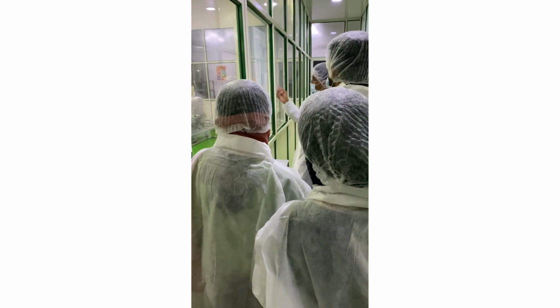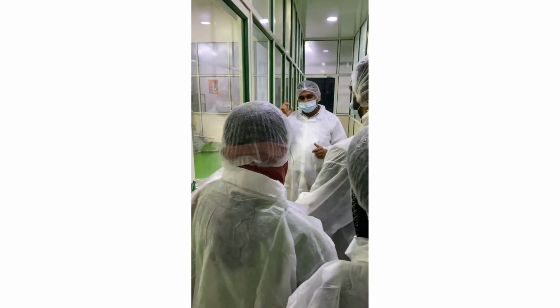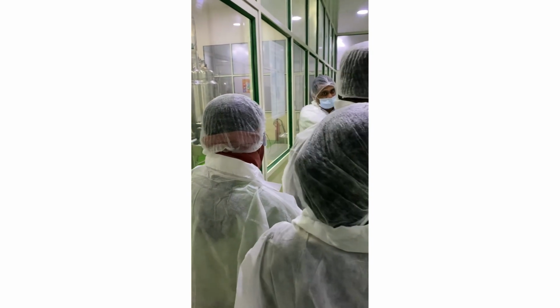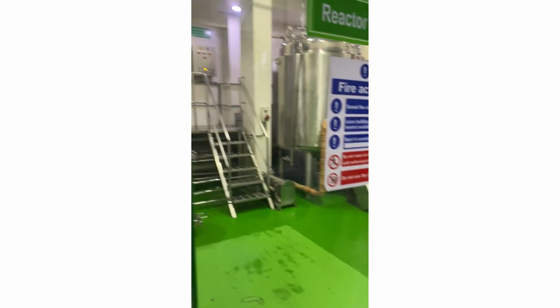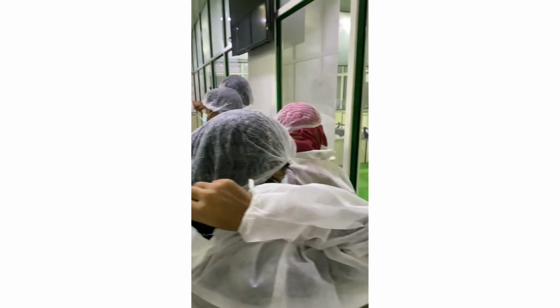This is the manufacturing of iPulse, iCare, and iGlow. Here we mix it, we heat it, then we do pasteurization, and then it goes to filling. The lines are there. You can see the lines, all connected. From there it will go there, then it will be coming here.